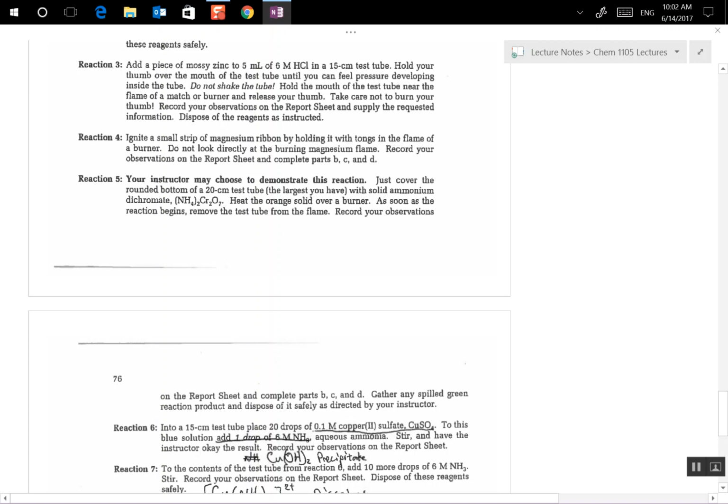Number 5, I'm actually going to do that reaction. I will demonstrate it to the class, and then you will finish filling everything out from the demonstration.